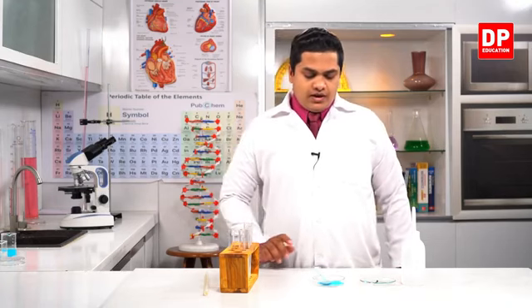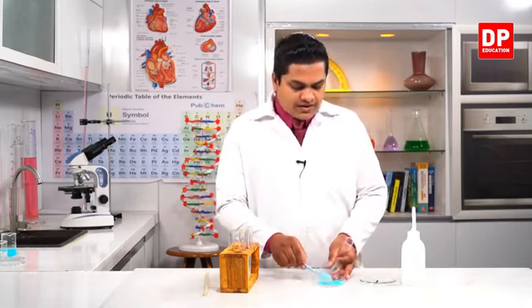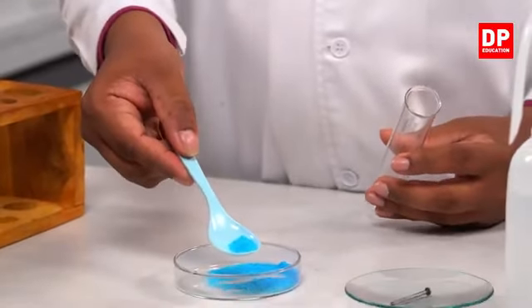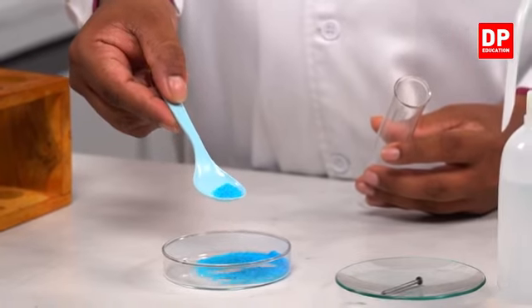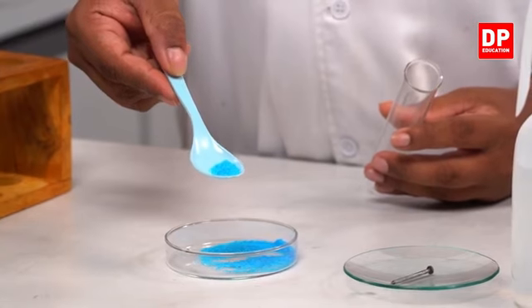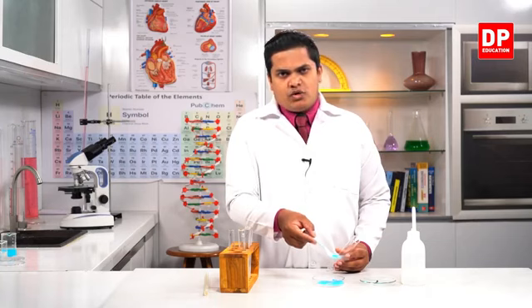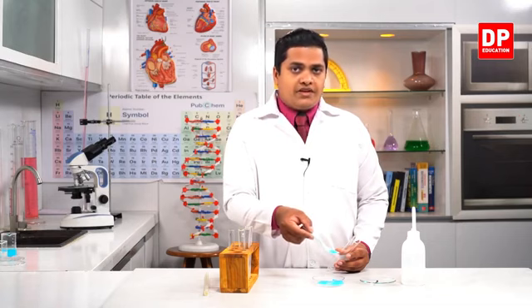So first of all, I'm going to add some amount of copper sulfate. So this is copper sulfate. Copper sulfate is a blue color crystal powder, and you can also get copper sulfate as a crystalline solid like a piece of rock, blue in color, right? To dissolve the copper sulfate quite easily, I have taken it in powdered form.